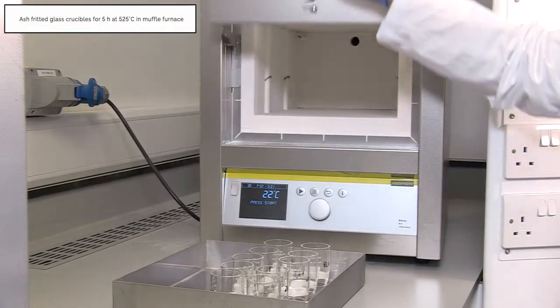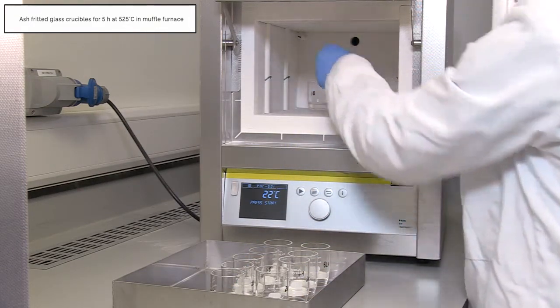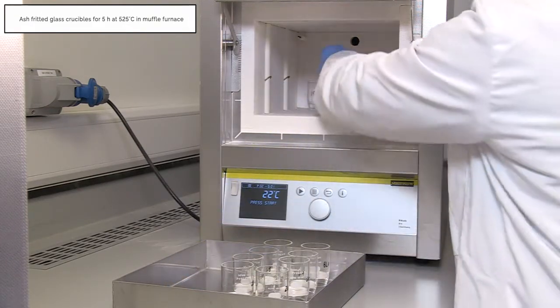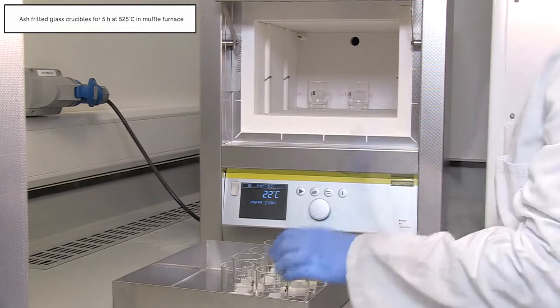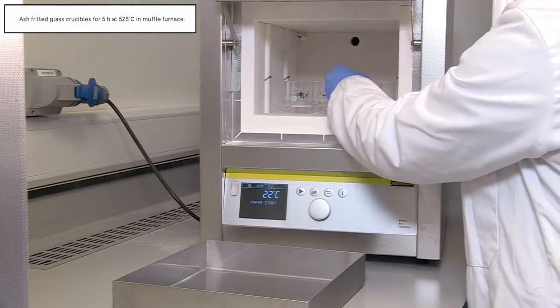Ash fritted glass crucibles for five hours at 525 degrees Celsius in a muffle furnace. After five hours, the furnace is programmed to cool to room temperature.